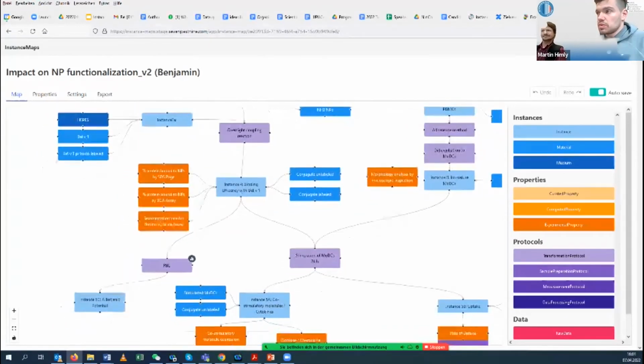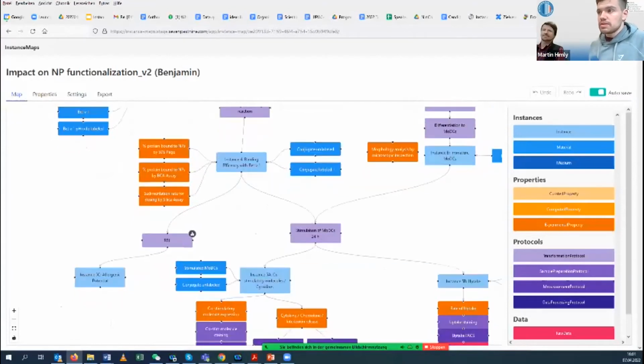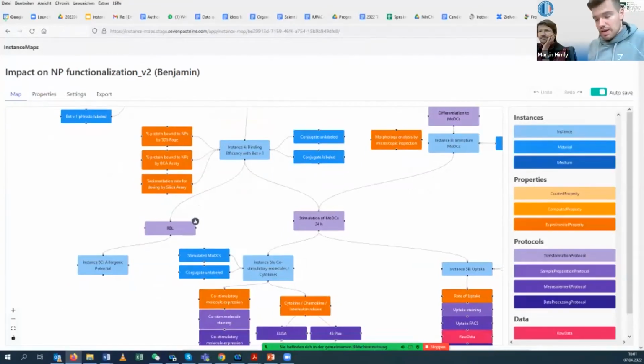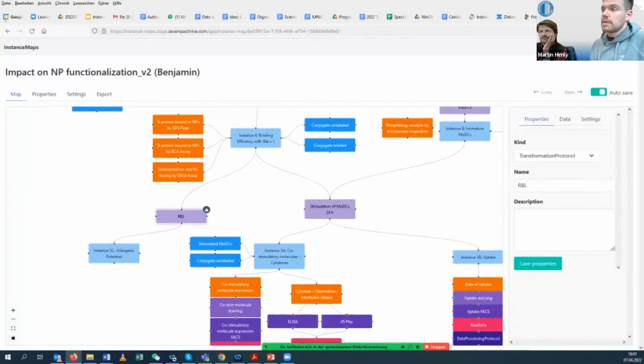But to go now into what we will be talking about, into the SOPs later on, after you coupled the model protein, the BETV1, with the particles, you have to check if there have been some structural alterations of the proteins of the BETV1. And here the RBL, the Hurbel assay, comes into play.